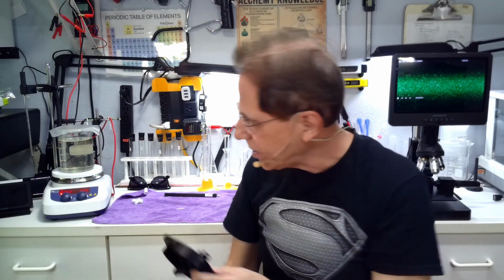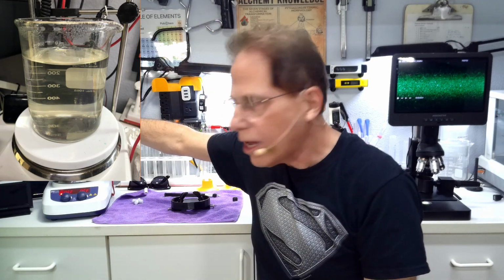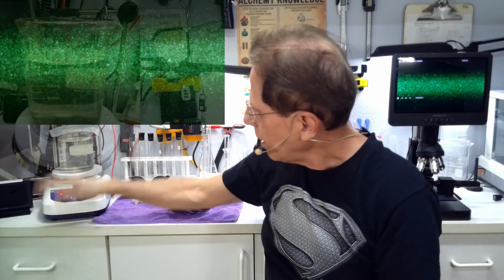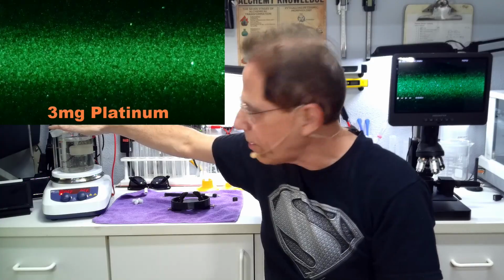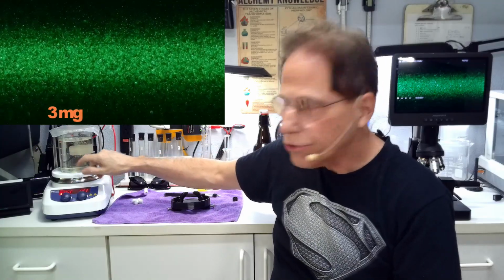The purpose of that experiment was what we got here. It took an hour to cook. This is my second successful batch of plasma arc platinum. And this is a 6 parts per million batch, about 3 milligrams worth of material. And you can see it has a very light brownish color to it.